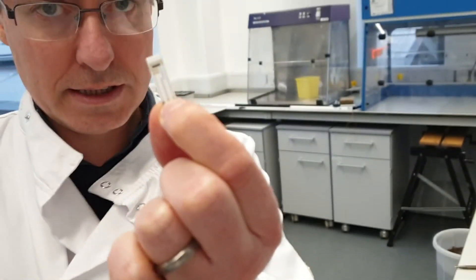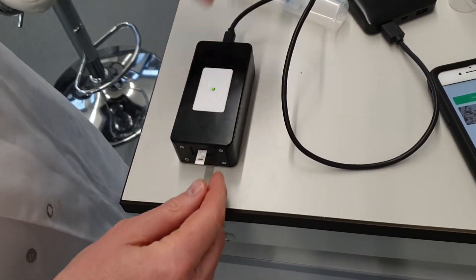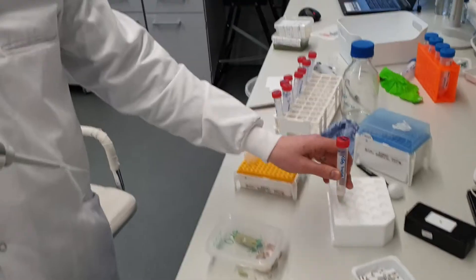The next thing we're going to do is take one of these garlic sensors and put it in the meter like that. Then I'm going to pipette just a little drop of extracted garlic.